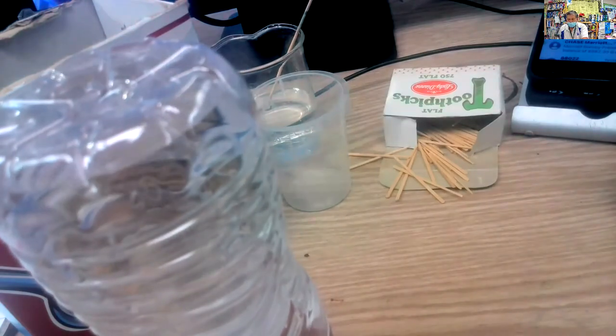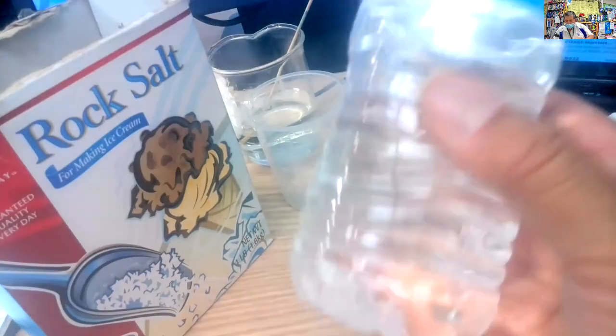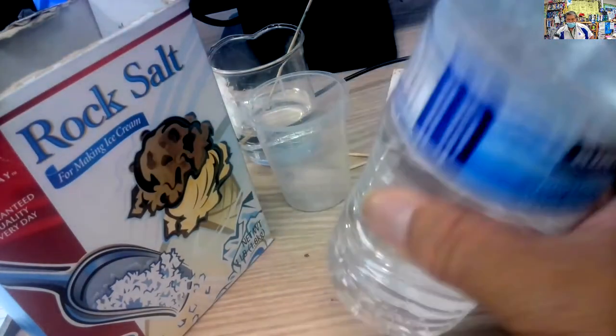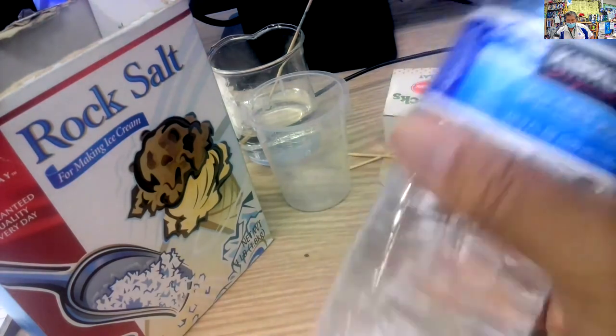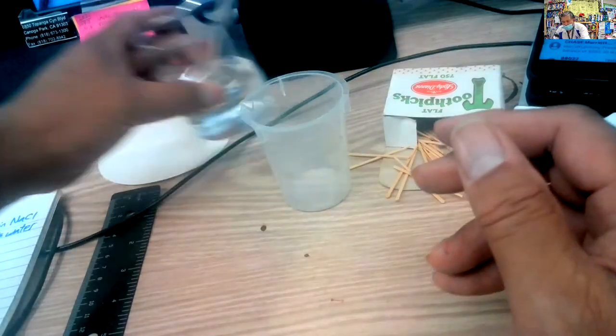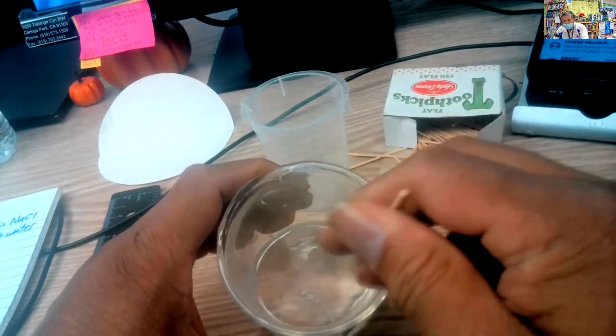If you have table salt, it's going to dissolve almost instantly. Well, I can see for me, I have some at the bottom right there. So I'm going to shake it around a little bit, just like I was stirring the other one. But if we look back at the other one, maybe it's done already. And yeah, it is. So let's go ahead and take this.